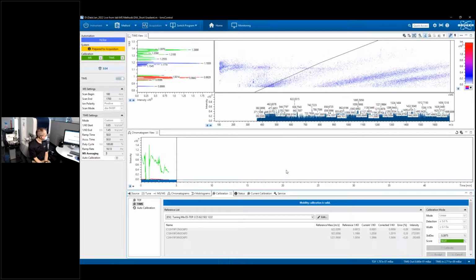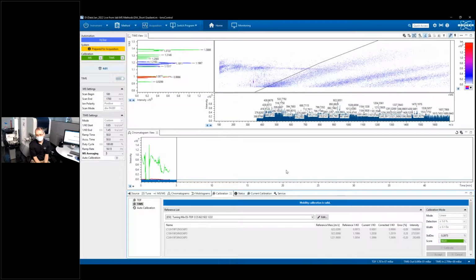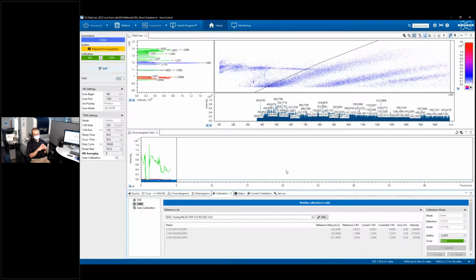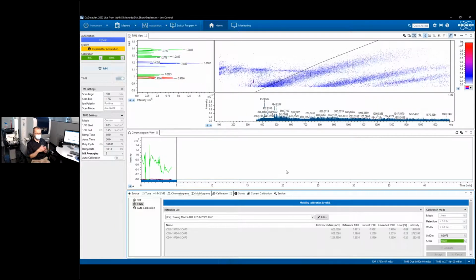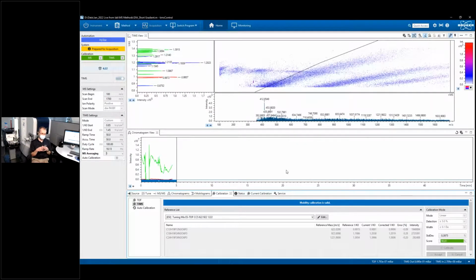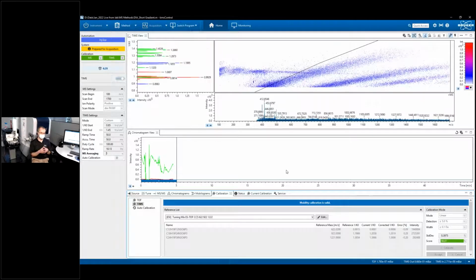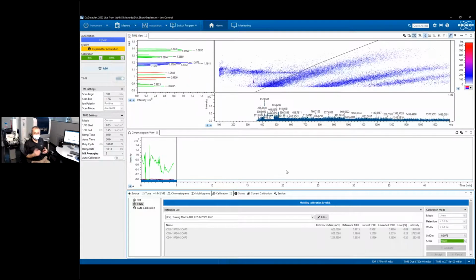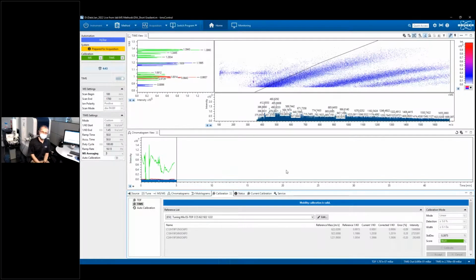Fantastic. Quick question, do you have a recommendation, DIA-NN versus MaxQuant? What are your views there? Yeah. So we tend to use DIA-NN at the moment, most frequently, or Spectronaut, here at least. I know MaxQuant was only released, I guess, middle of last year, to be able to process DIA data. At the moment, we've found that MaxQuant is not identifying quite as many peptides as both DIA-NN and Spectronaut, in our experience. It maybe takes a little bit longer to process the data. I think often it's more a case of what you feel most comfortable using, right?